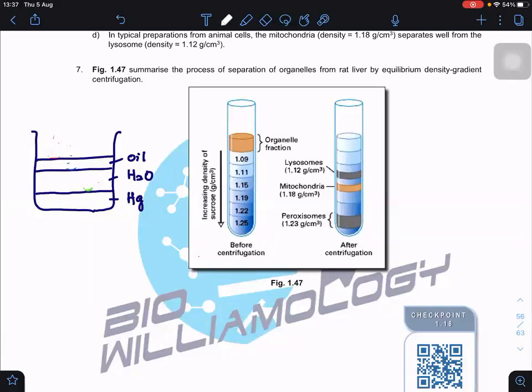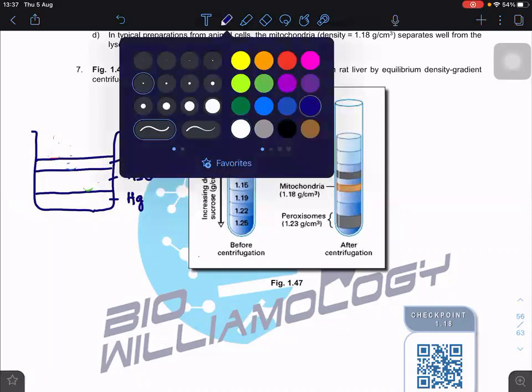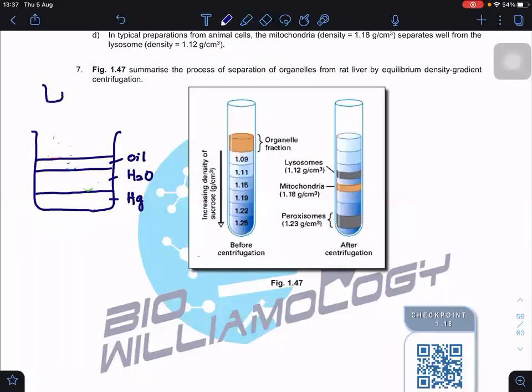So if I have a mixture now, a beaker of a mixture A, B, and C, initially I cannot differentiate them, right? But if I pour it inside here, then I can see that A now stays here, B stays here, C will stay here. Correct? Why? Because now we can differentiate them based on their density.